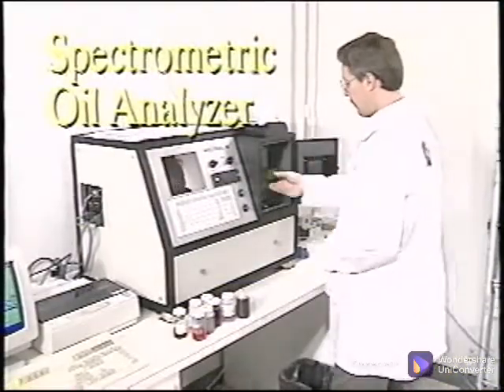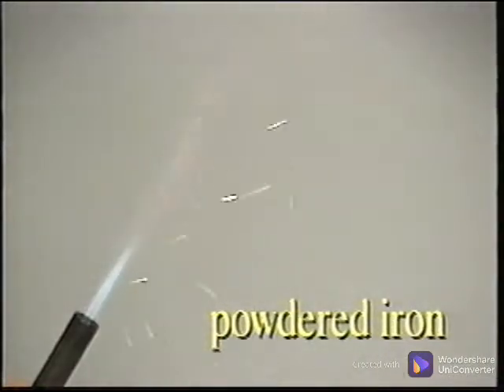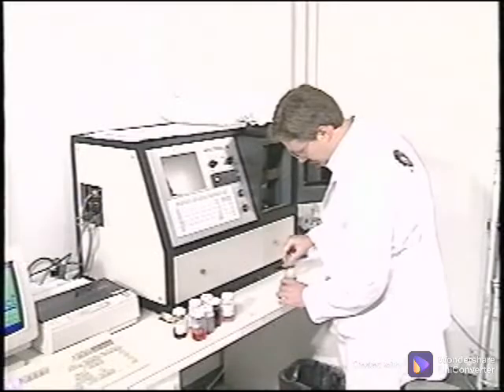The next analysis is the spectrometric oil analyzer, which determines the elements in the oil. Each element emits precise spectral colors when ignited, and by igniting the sample and measuring and separating the wavelengths of color light into the color spectrum, the elements that are present are determined.